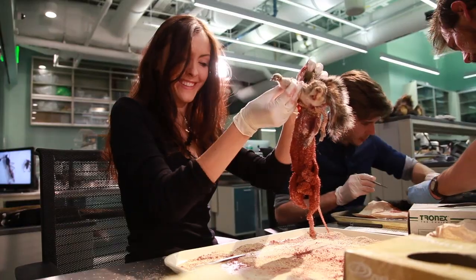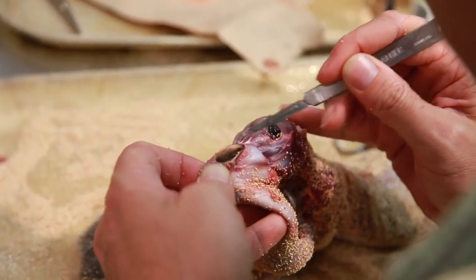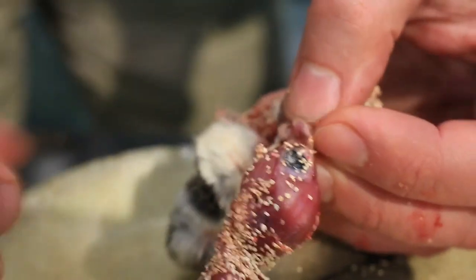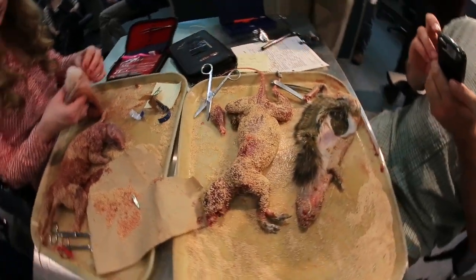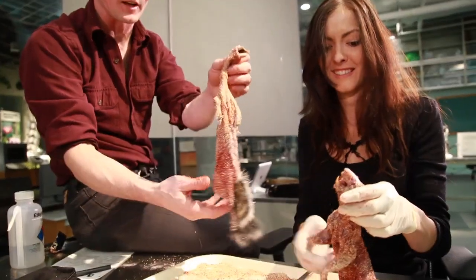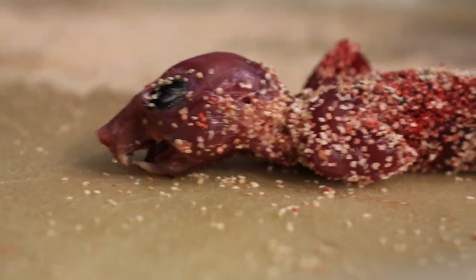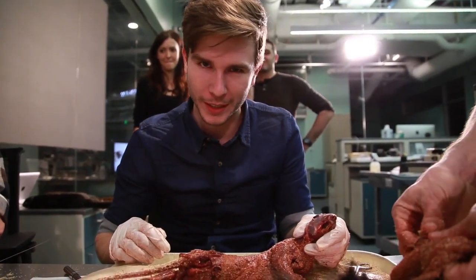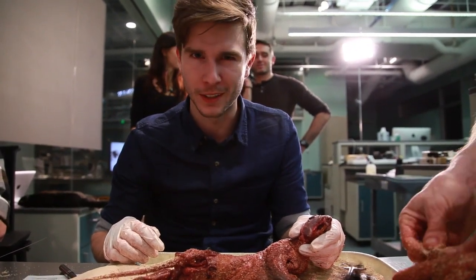Then you pull the skin on up the back, work the two forearms out, and then you have the head as the last bit. You've got to clip at the ears, clip at the eyes, and then finally clip at the nose, and then you have the skin on one side and the carcass on the other. You don't really have an appreciation for how well your skin is put on your own body until you have to take some things off.